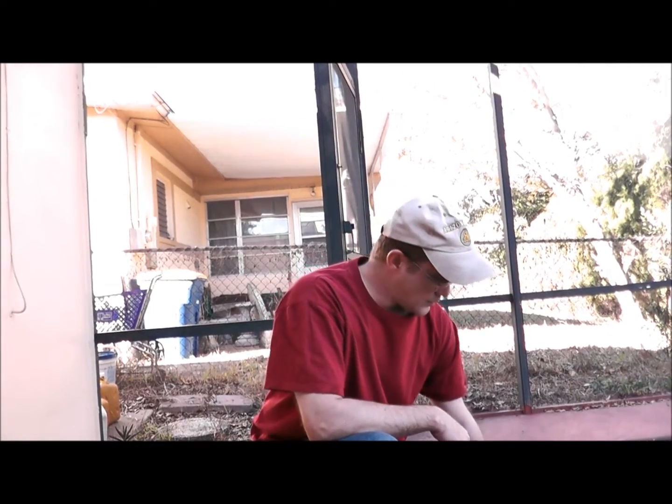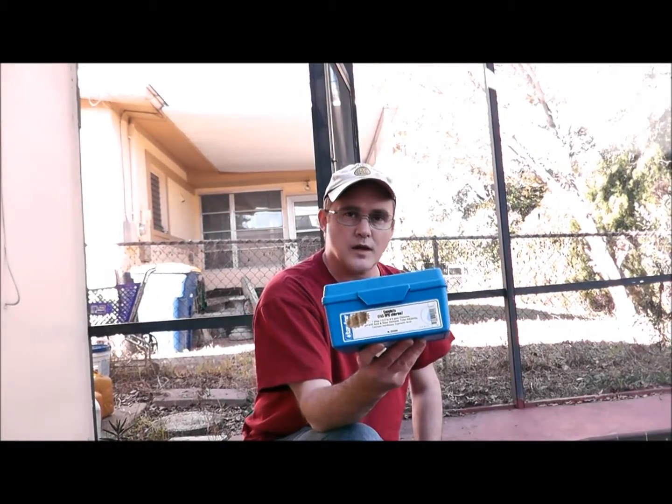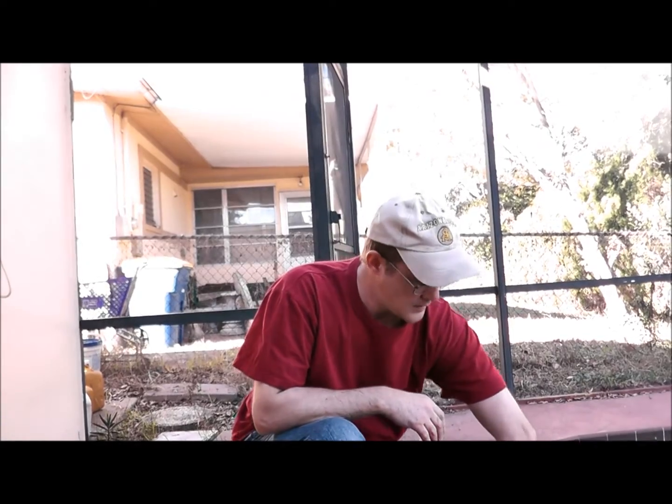Hey, this is Robert with Clean Pool and Spa. In this video I'm going to teach you how to take your total alkalinity in your swimming pool using your K2006 pool water test kit. If you don't have this kit, I suggest you get it because it's going to give you the most accurate readings.